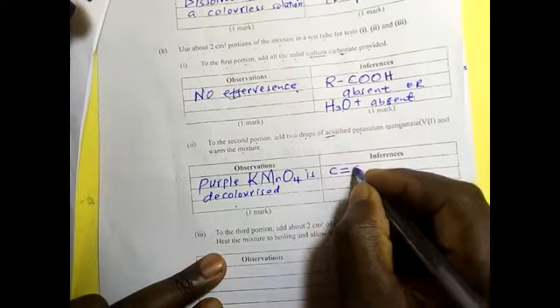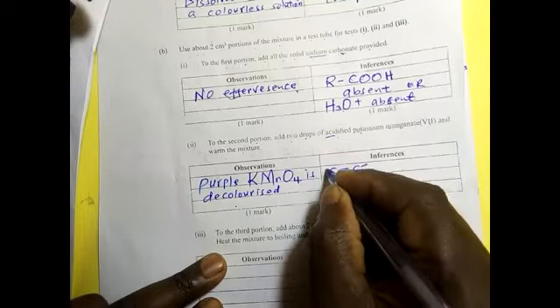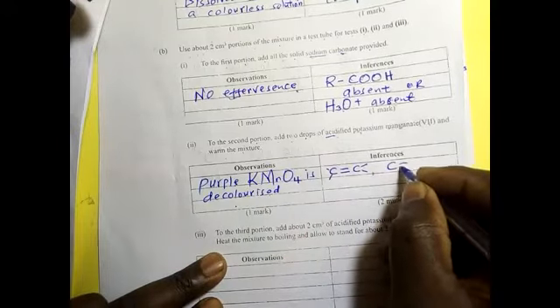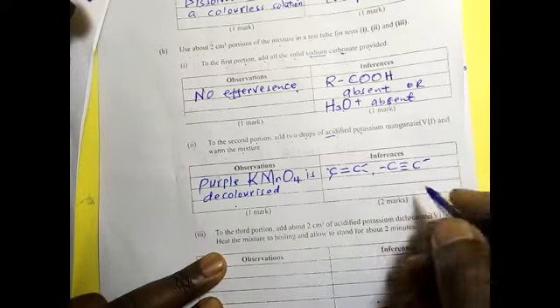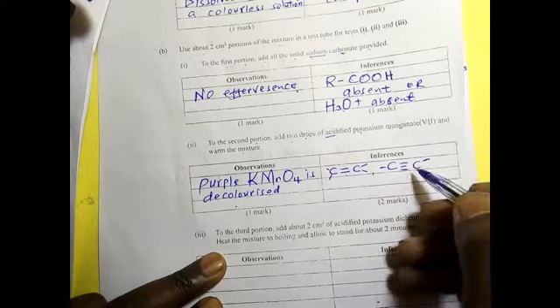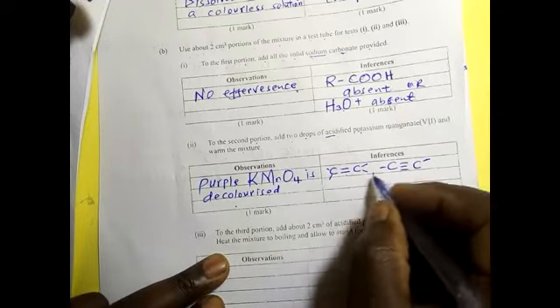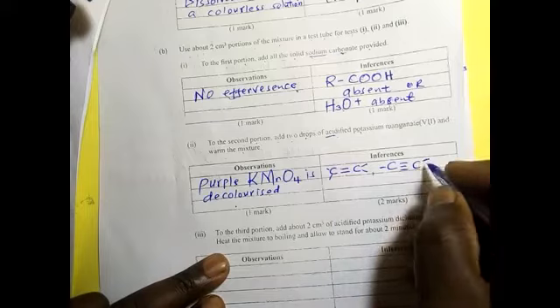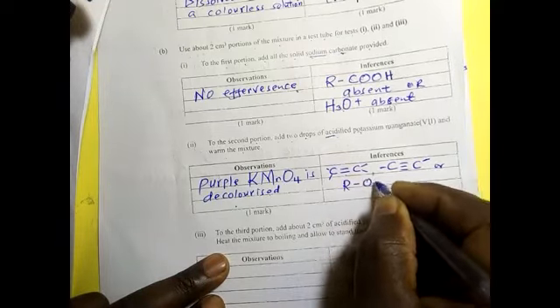So if that happens, then it means that there is a double bond. That organic compound could be an alkene or an alkyne. Please avoid writing alkene or alkyne in words because they usually ignore that. Or an alcohol is present.